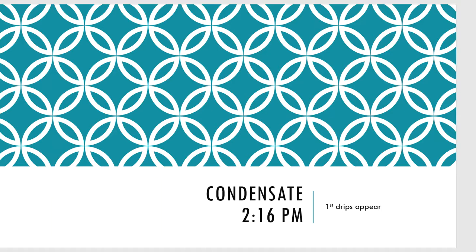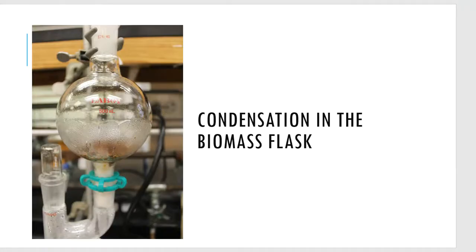This is beginning to heat up and I start to see that condensate at about 2:16. So folks, that's about 30 minutes for the water to heat up, start turning into vapor, condensing onto the sides of the Claisen adapter, and falling back down into the boiling flask. Eventually the condensation gets into the biomass flask too — you can see condensation all on the sides of the biomass flask, which is a good sign that heat is starting to hit the cloves.